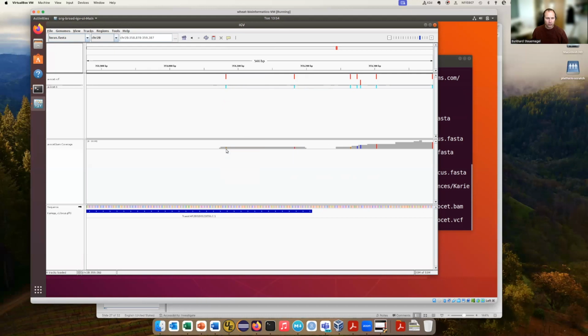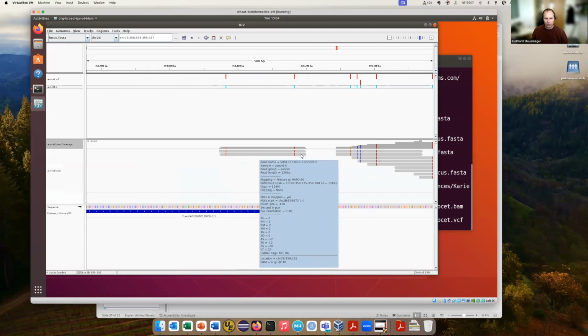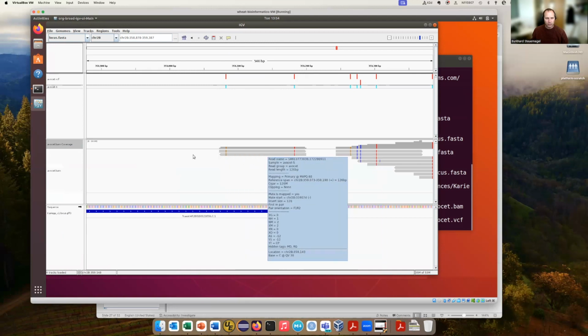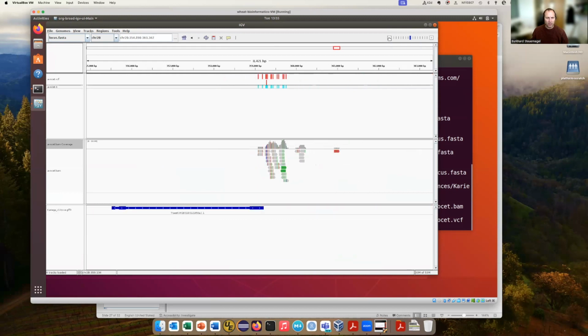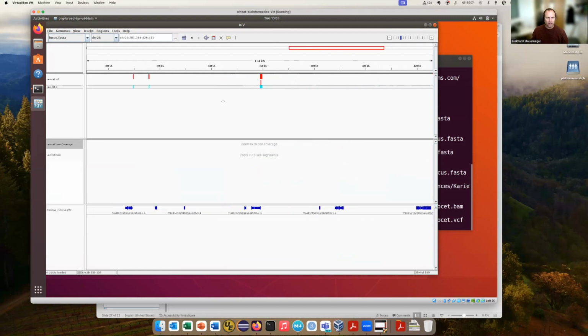This pretty much matches what we can see here in the reads. So if we load the alignment track on top of that, we can see we have only 2 reads here. So that's not a lot of statistical information to call a SNP here. That might just as well be some sort of wrong mapping. Okay, so what else is there? Let's zoom out a little bit further.